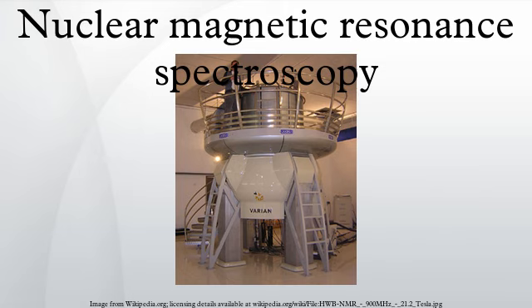Modern NMR spectrometers have a very strong, large and expensive liquid helium-cooled superconducting magnet, because resolution directly depends on magnetic field strength. Less expensive machines using permanent magnets and lower resolution are also available, which still give sufficient performance for certain applications such as reaction monitoring and quick checking of samples. There are even benchtop NMR spectrometers.